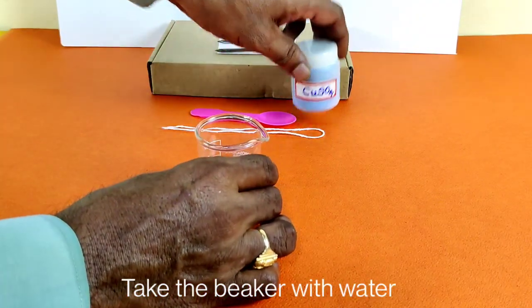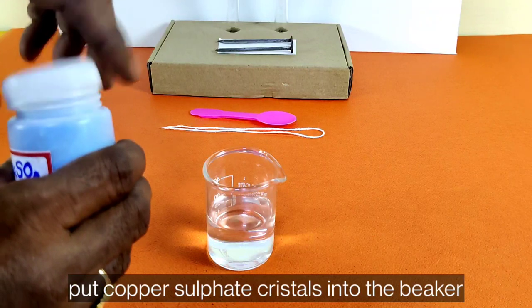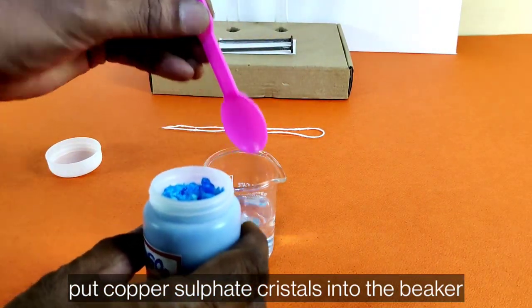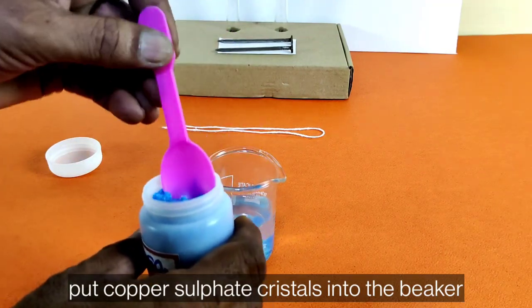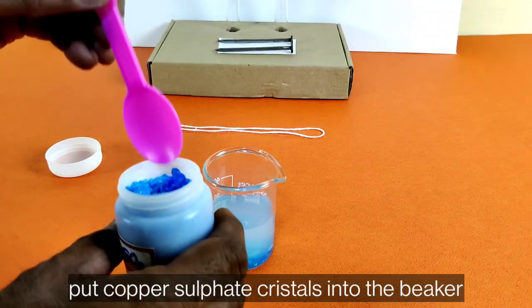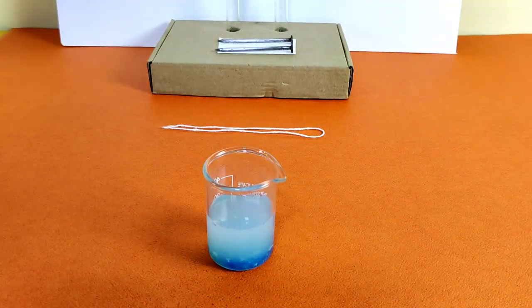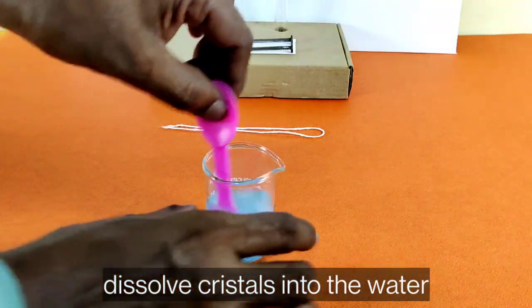Take a beaker with water. Put copper sulfate crystals into the beaker using a spatula, and dissolve the crystals into the water.